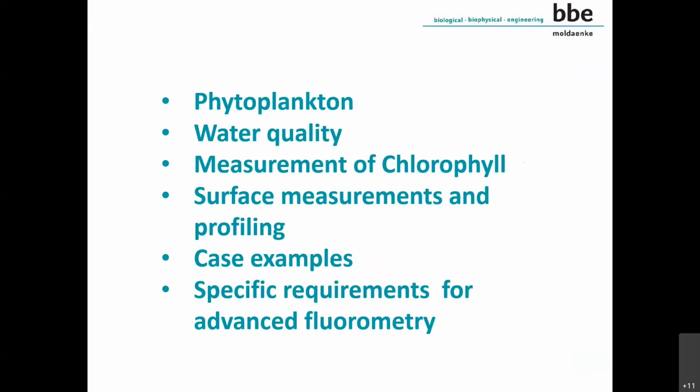I will tell you something about surface measurements and profiling. You saw in the beginning on the slide the AlgaeTorch and the FluoroProbe that I wanted to present today. Then we have some applications or case examples where I can show you how these measurements were performed.